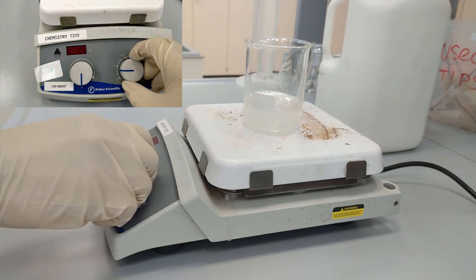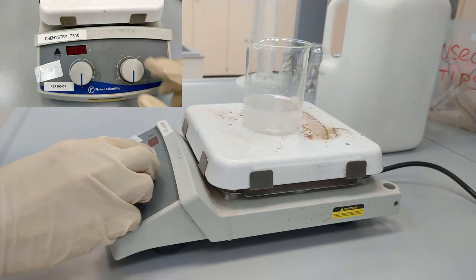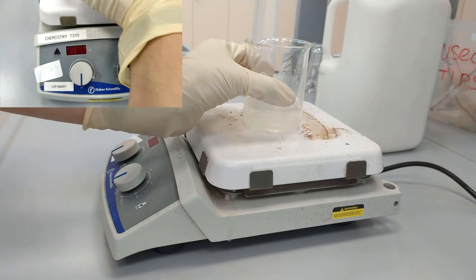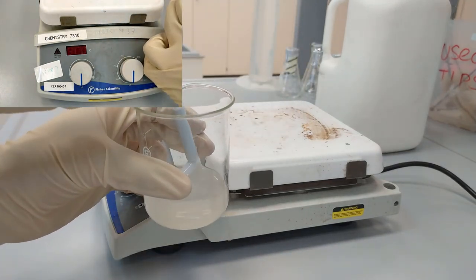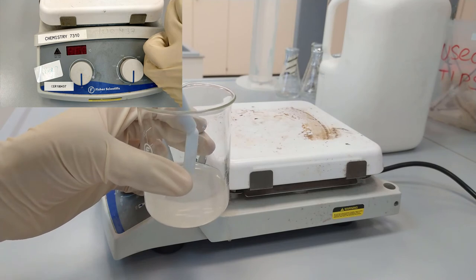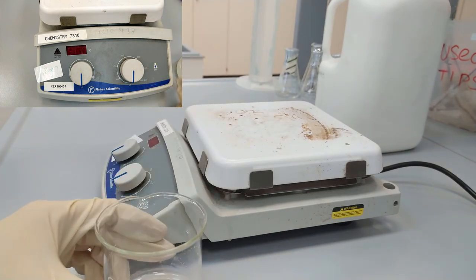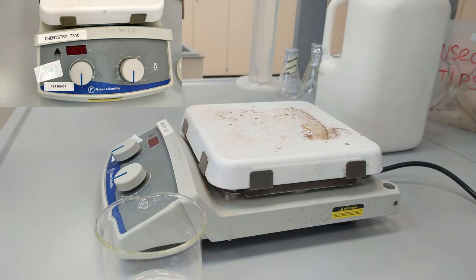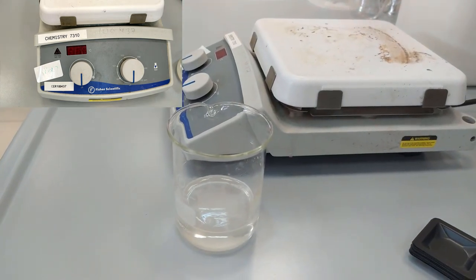So now we turn off the stirrer and you really see that it is transparent and homogeneous. Using a special magnet we are taking the magnet bin out. The next step would be adding another 50 milliliters to bring the volume to 100 milliliters.